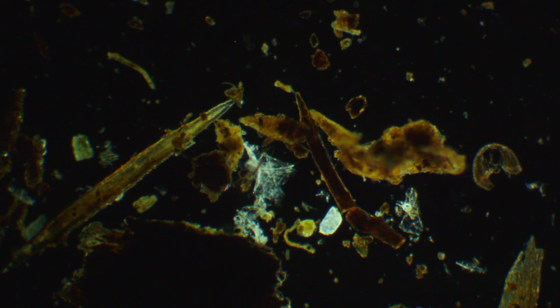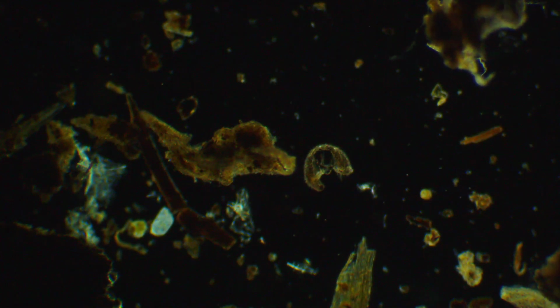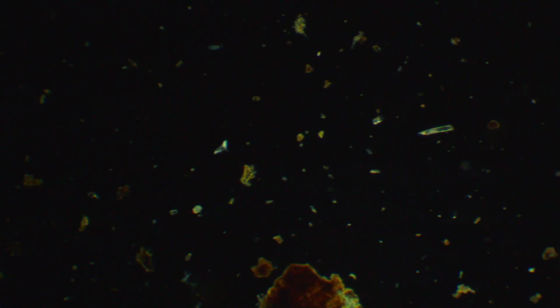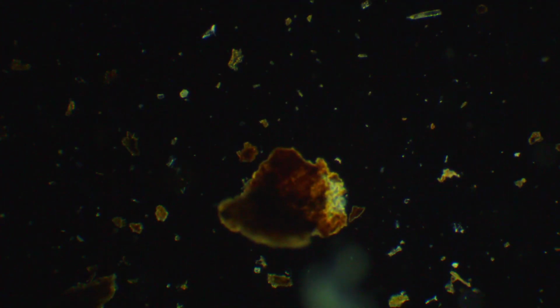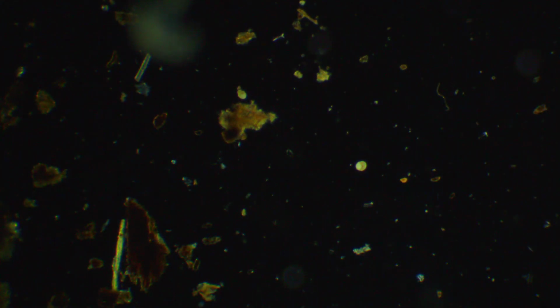It's an interesting crystalline, I don't know, fibrous kind of thing in here. I guess it's sand, but interesting looking. That's an interesting looking piece of plant matter, too. Another swimming guy right there that looks like another kind of paramecium looking thing. These little round things are kind of interesting. I wonder what those are. It's round green spore-like things.